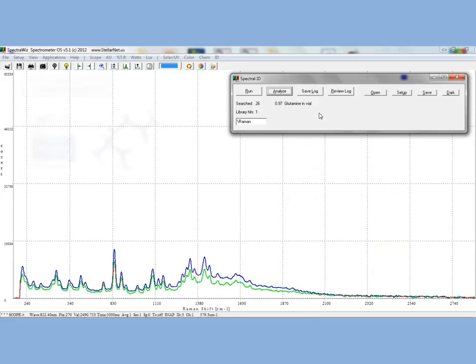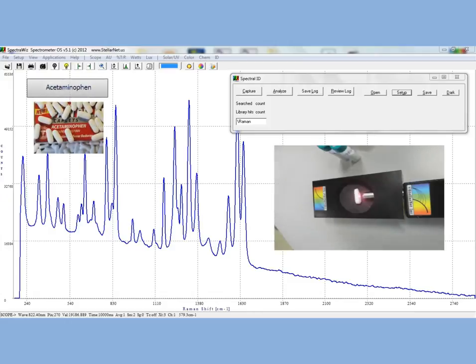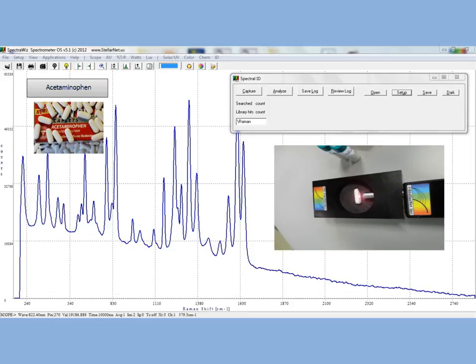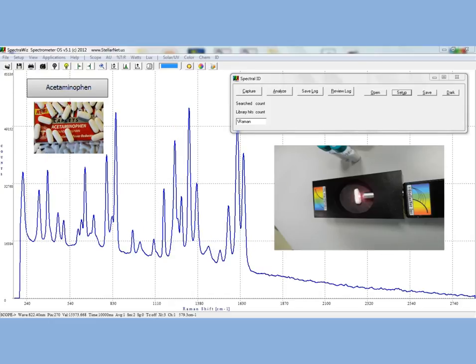In this next example, we will be looking at acetaminophen. Acetaminophen is a widely used over-the-counter pain reliever and fever reducer. It is commonly used for the relief of headaches and other minor aches and pains and is a major ingredient in numerous cold and flu remedies. In this demonstration, we will be taking the Raman spectrum from one of the sides of a scraped Tylenol tablet.